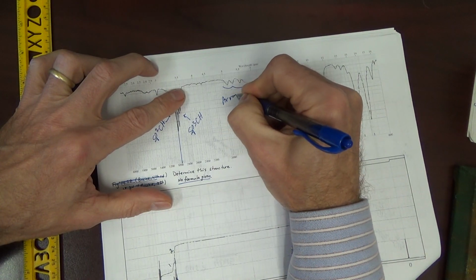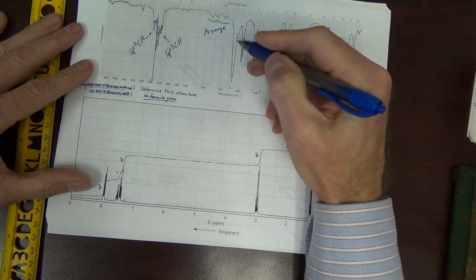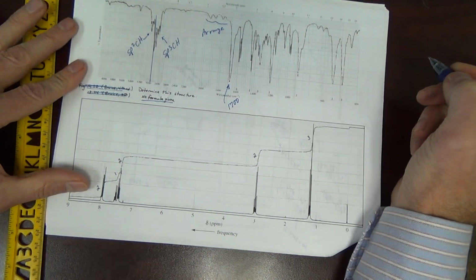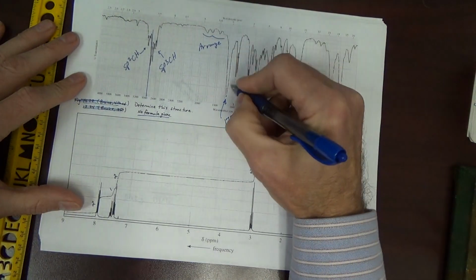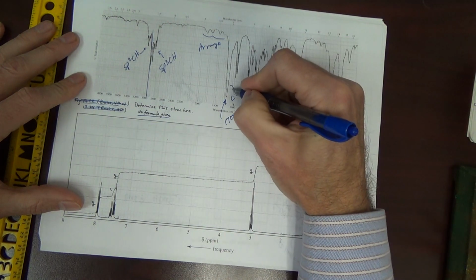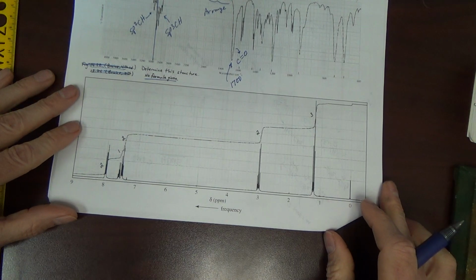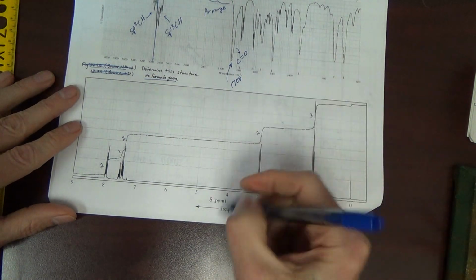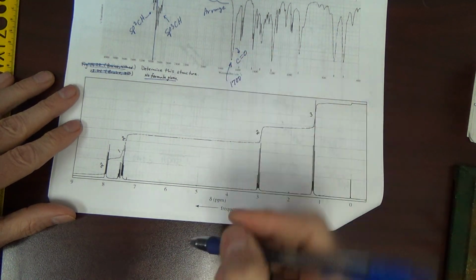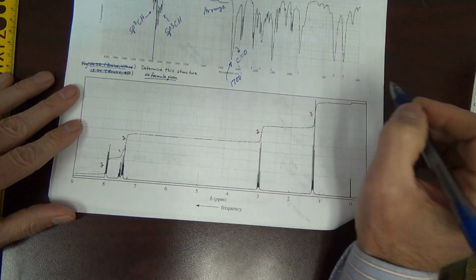Aromatic range. 1700. What is that? Looks like a carbonyl. Which, by the way, you're not going to see the carbonyl in the proton NMR because there's no protons here. Okay? I mean, if you're just looking at the C and the O.